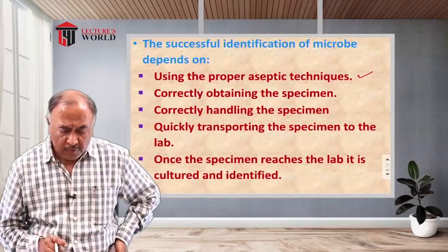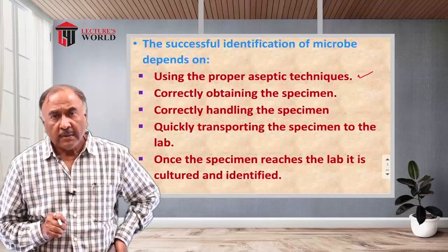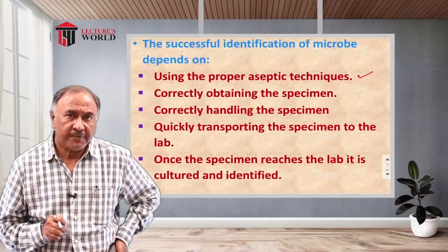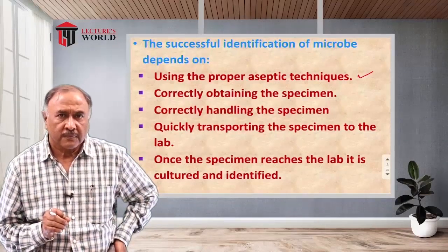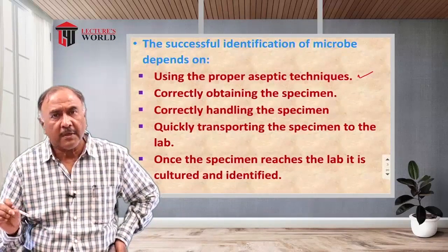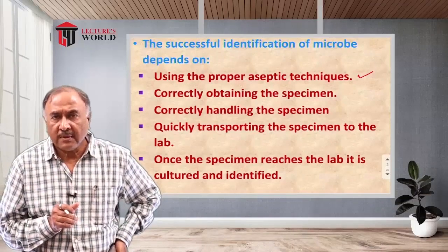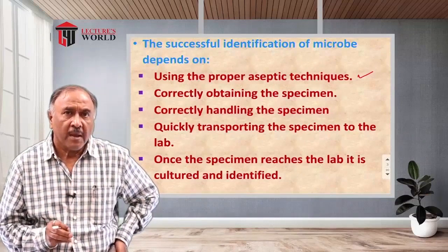first, the use of proper aseptic technique. The sample which is being collected from a patient has to be collected under proper aseptic conditions. Now, why is this given such huge importance?